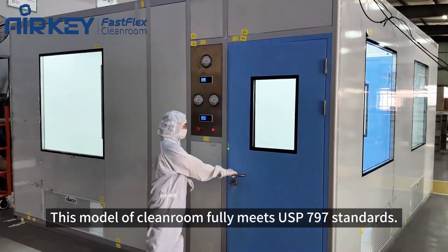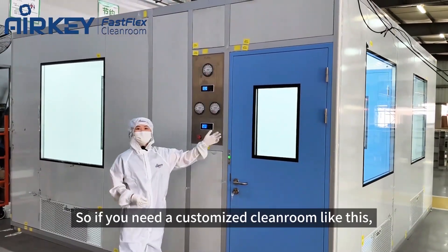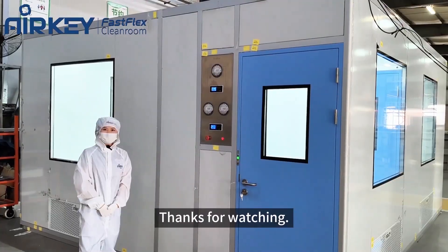This model of clean room fully meets USP797 standards. So if you need a customized clean room like this, please feel free to contact us. Thank you so much for watching.